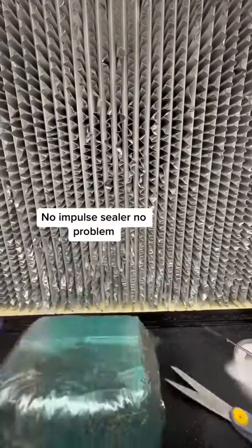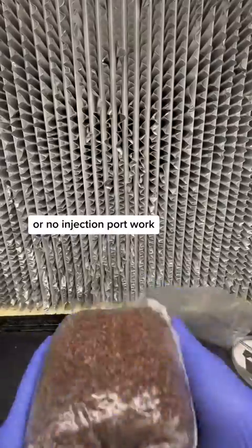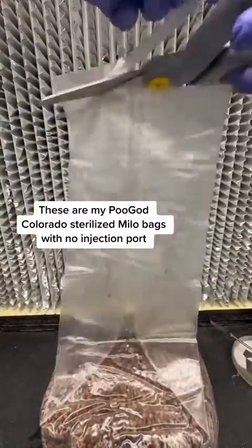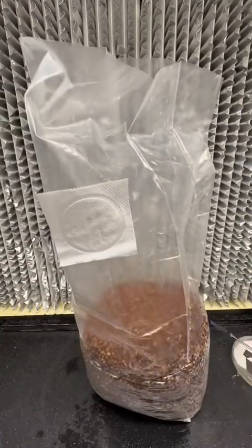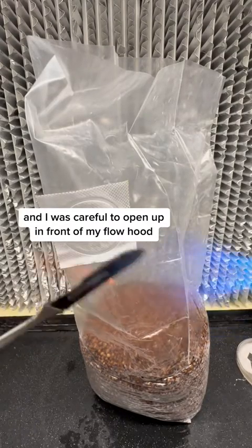No impulse sealer? No problem. Here's a quick zip tie hack to help with any of your agar work or no injection port work. So clean off your bag. These are my Pugod Colorado sterilized Milo bags with no injection port. I cleaned it off really nicely and I was careful to open up in front of my flow hood.